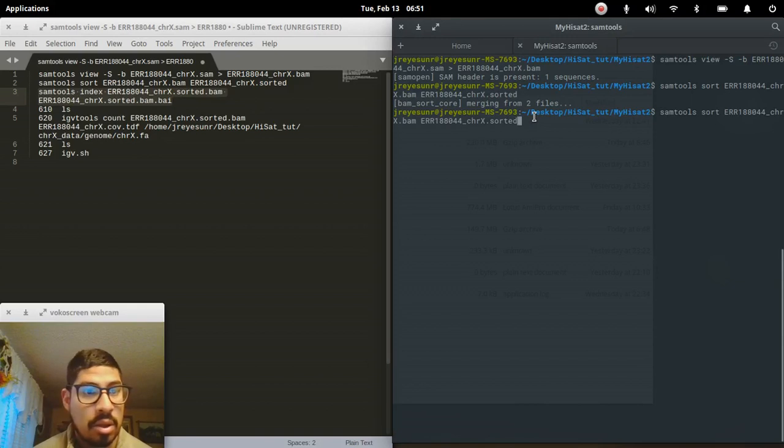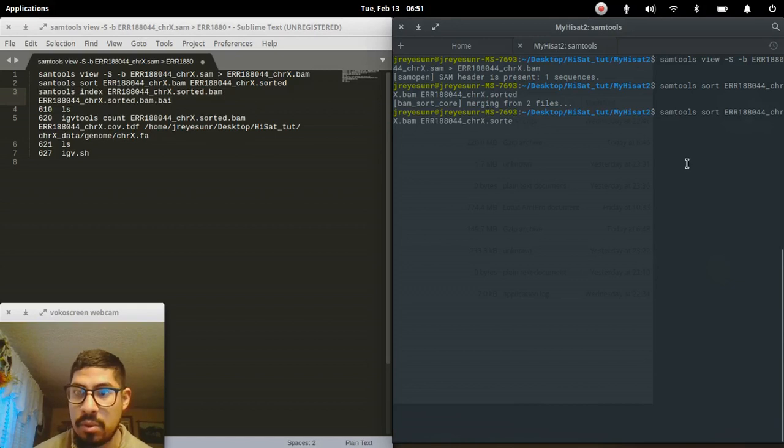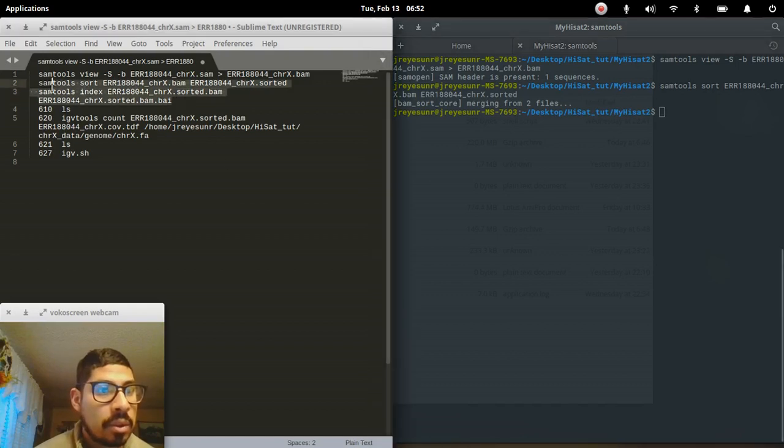Oops, that's the wrong one. So, I forgot you can't use delete. There we go. So it's this one right here.